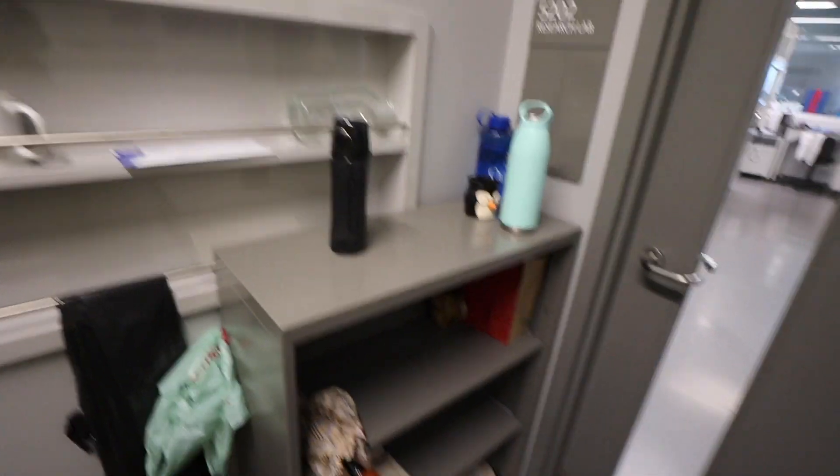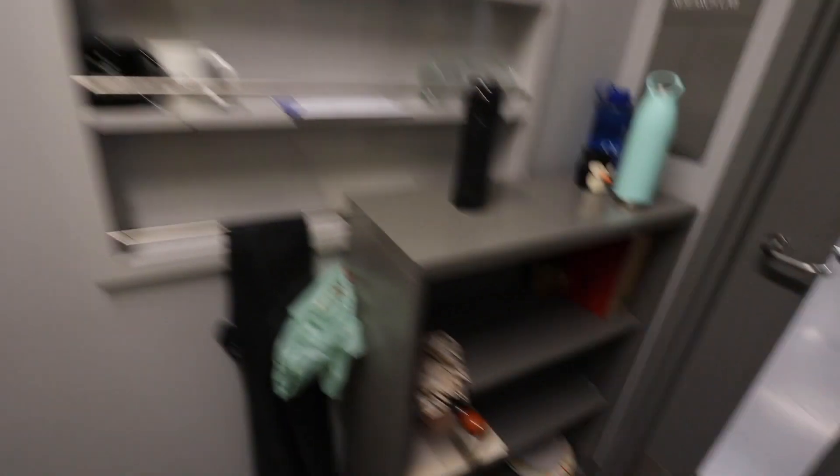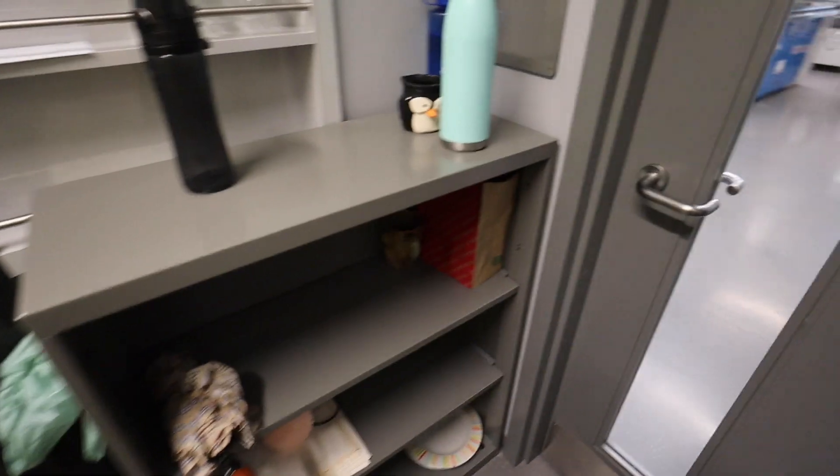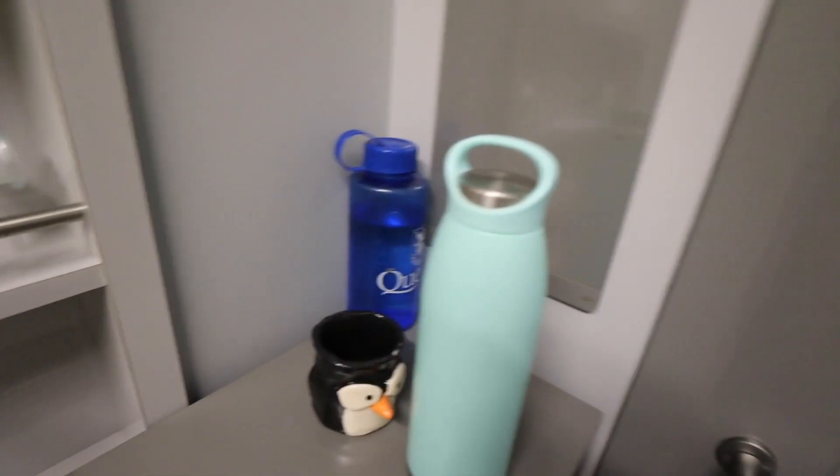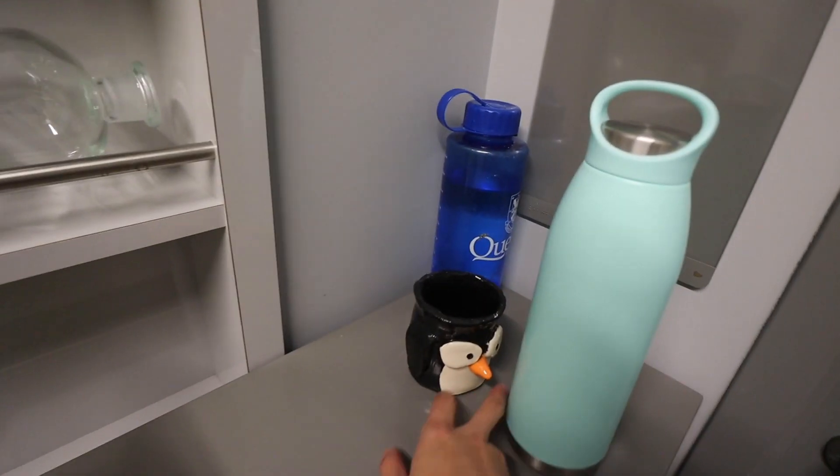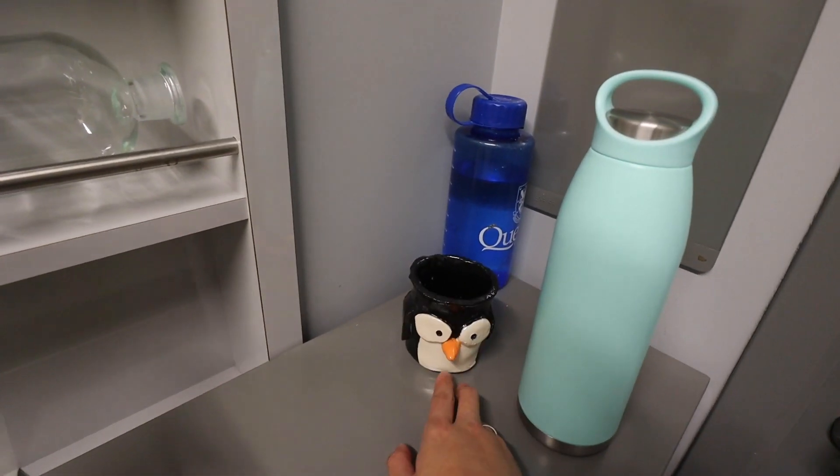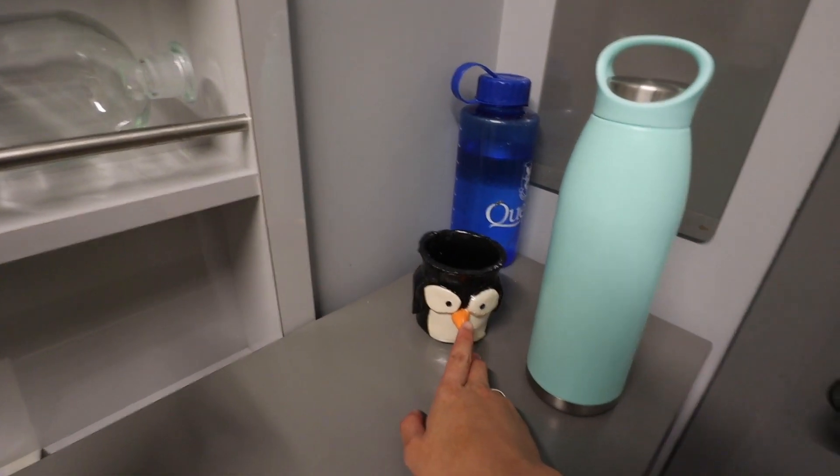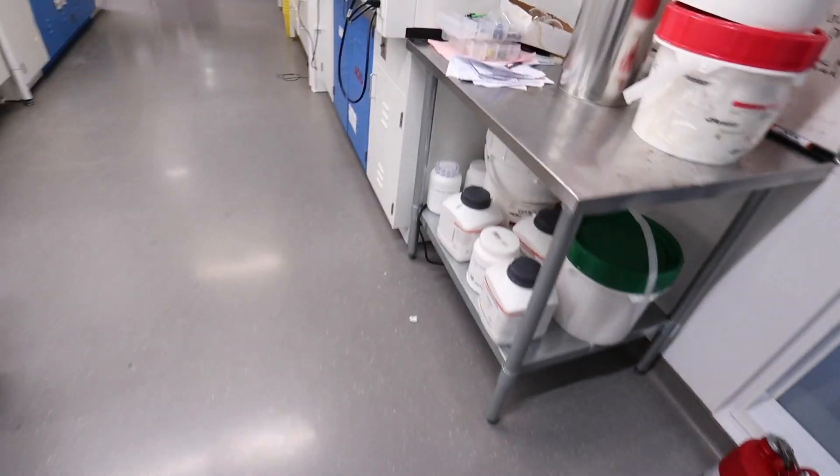So first of all, this is the entrance before the entrance where we put our coats, our stuff. I usually put my lunch and stuff here. This is my water bottle and my mug that we made with the lab and this is the actual entrance to the lab.